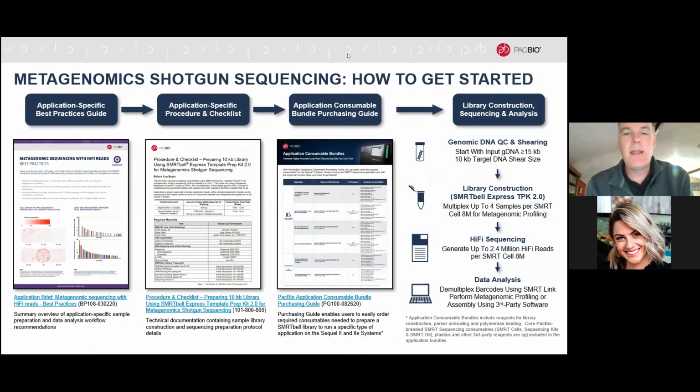So that's probably enough. Moving on now from the 16S and getting onto the full length sequencing, the metagenomic shotgun sequencing, as it's called here. As a general overview, there are protocols, handy hint sheets and best practice guides available. They're on the PacBio website, but contact somebody at Millennium Science, myself or one of my colleagues, and we'll get these out to you.